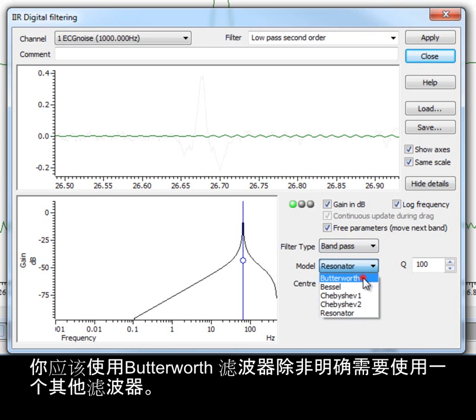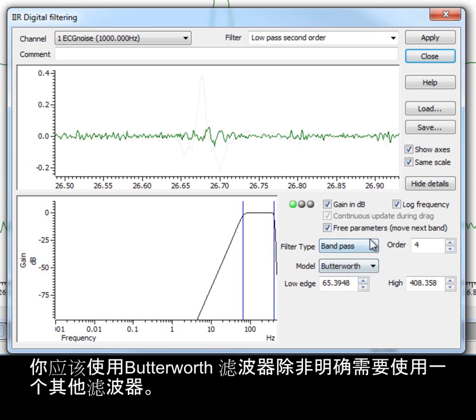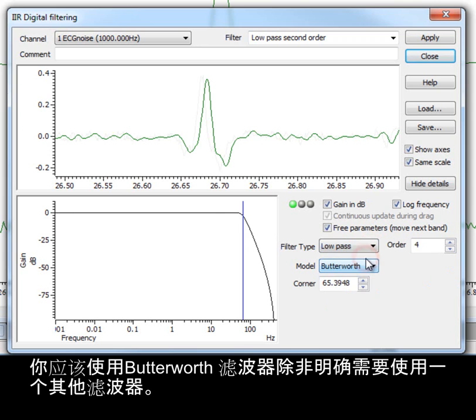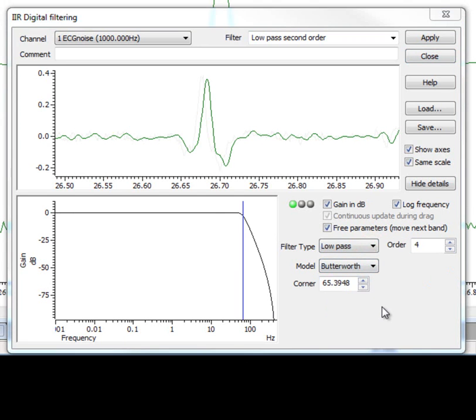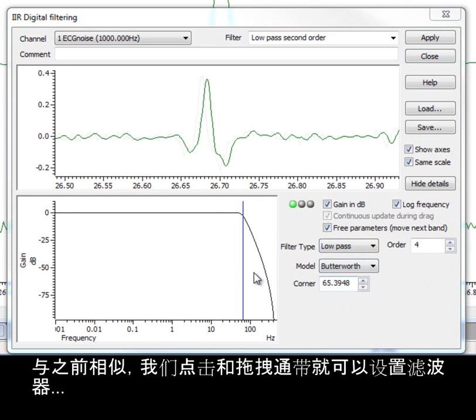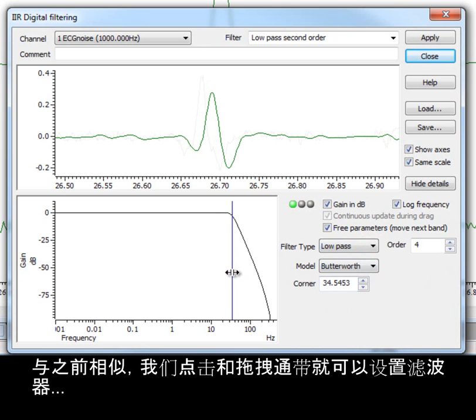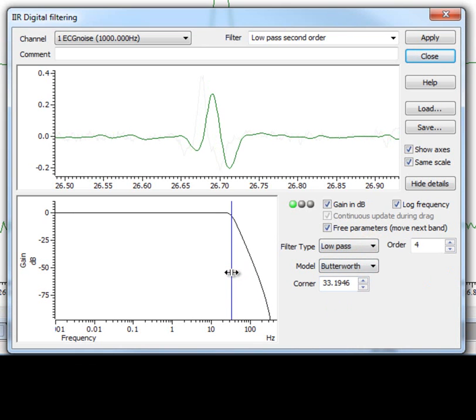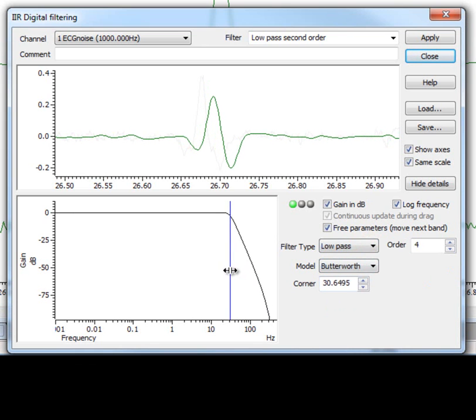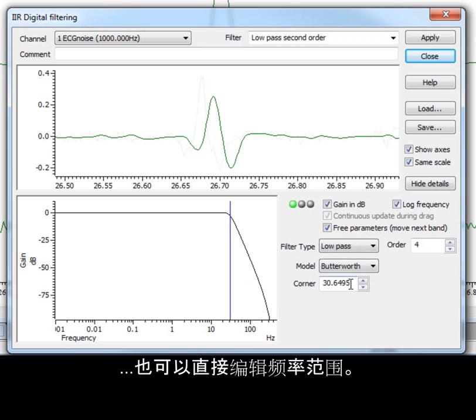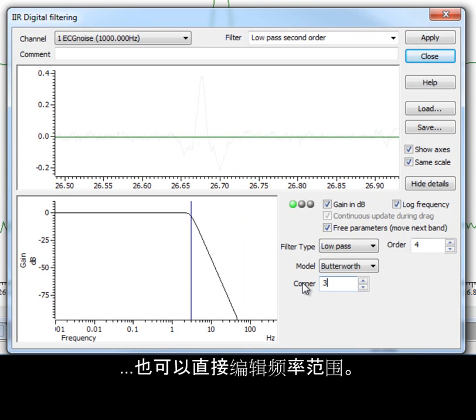Unless you know that you need a different model, you should use a Butterworth filter. By clicking and dragging the bands, we can set up our filter much like before. Or edit the corner frequency directly.